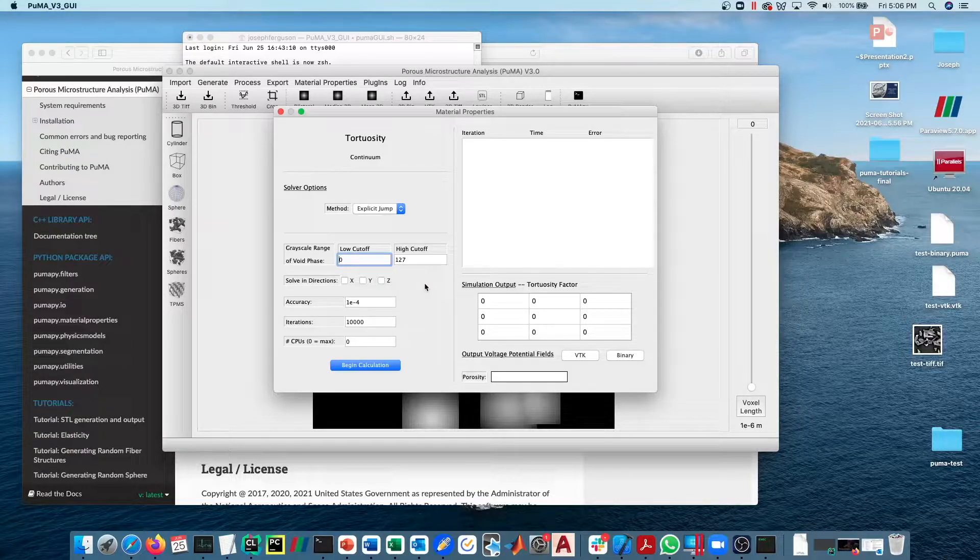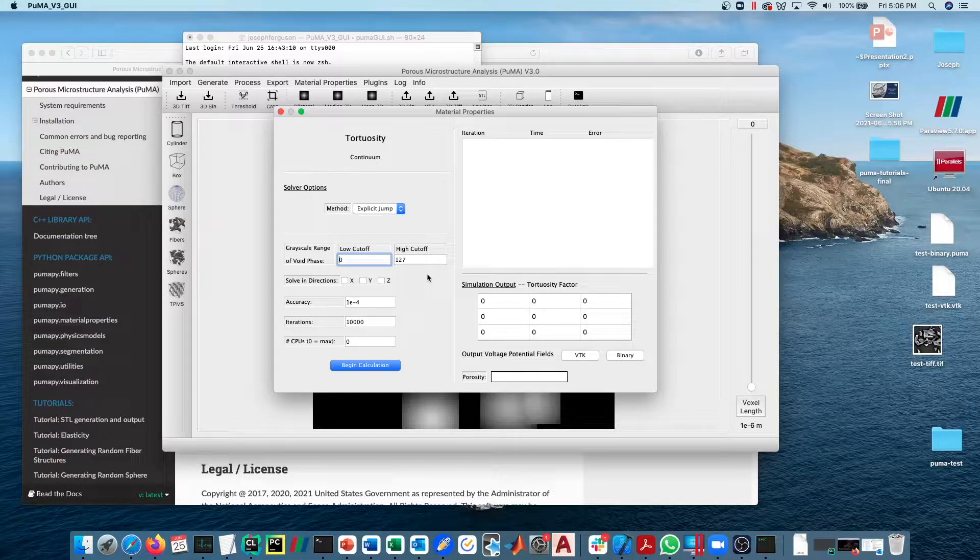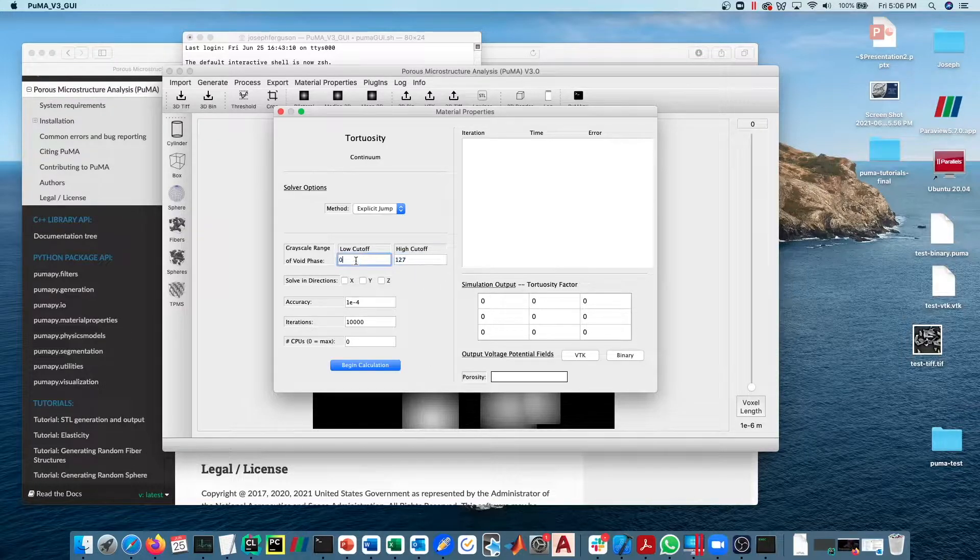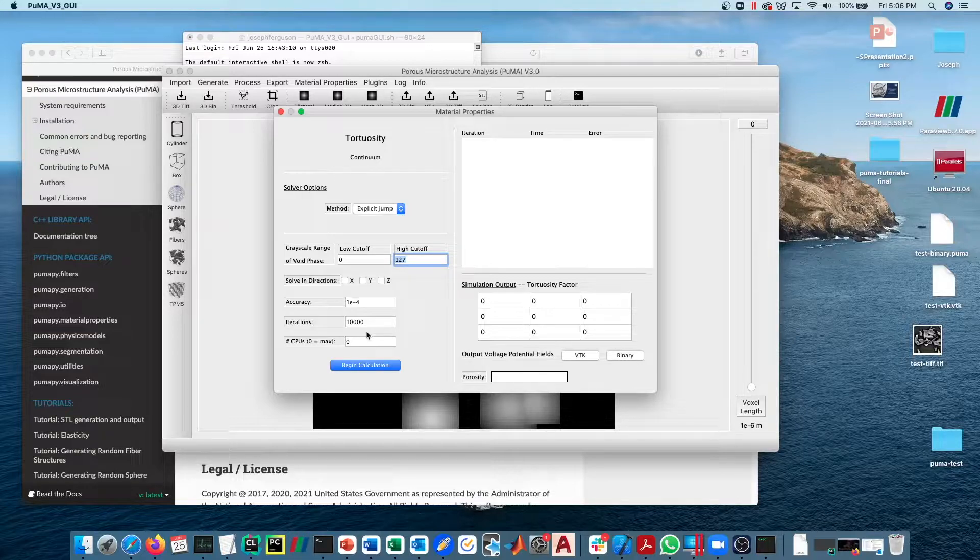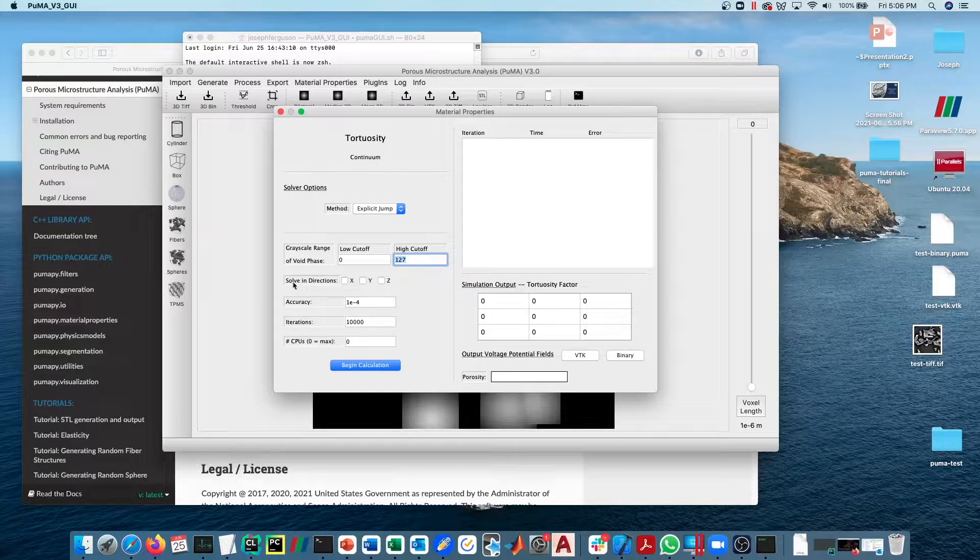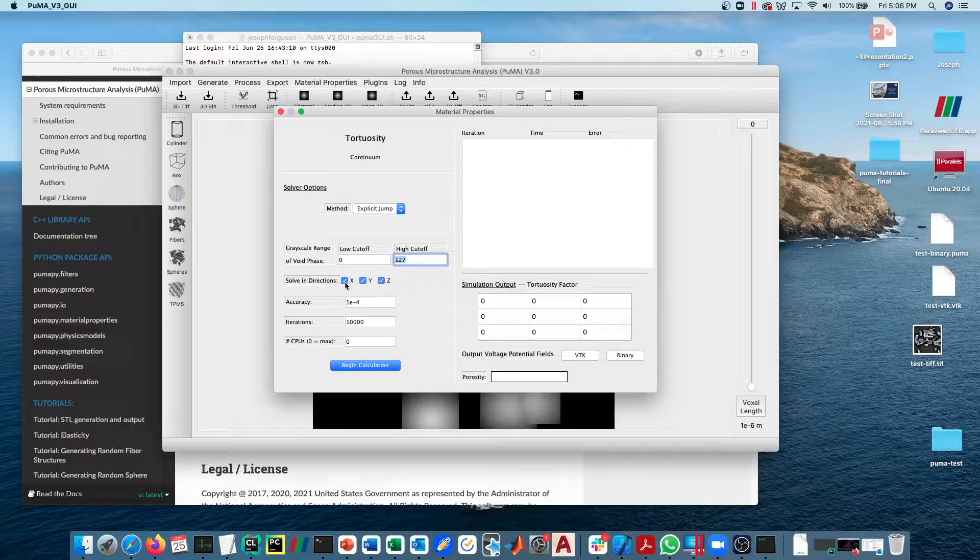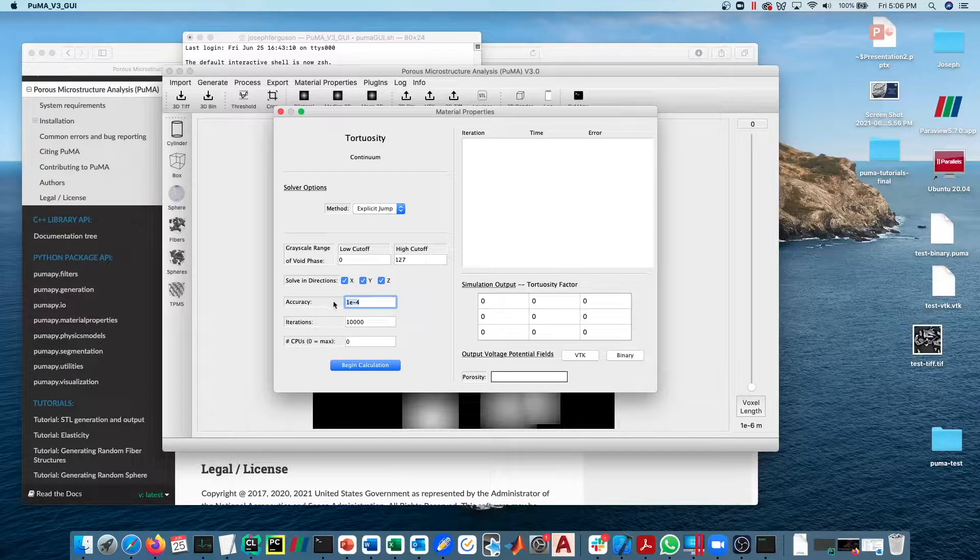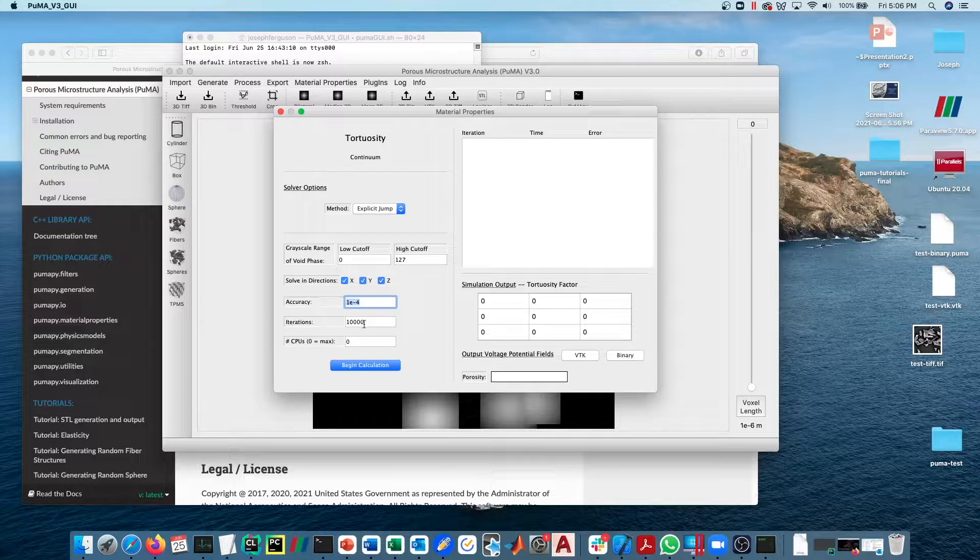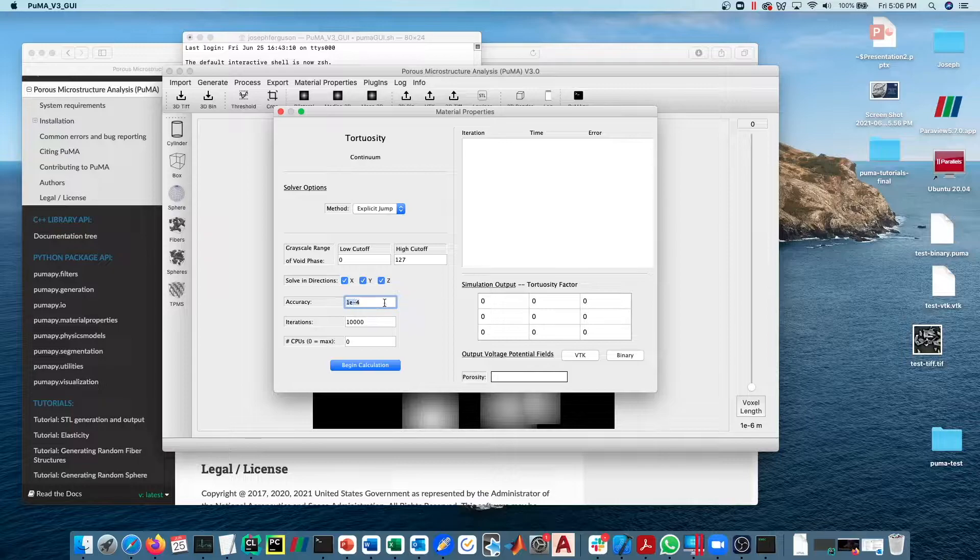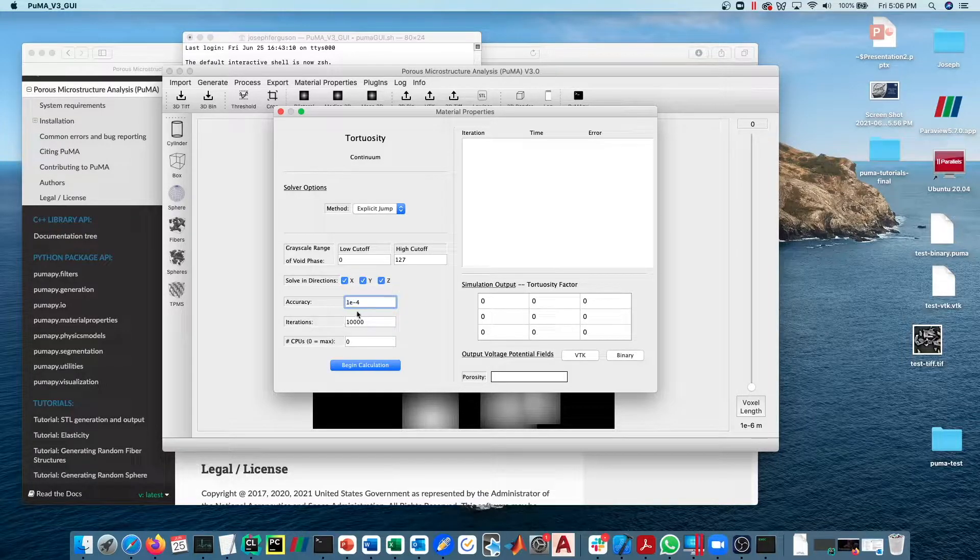Let's start with the explicit jump solver using periodic boundary conditions. The grayscale range of the void phase has to be specified. By void phase I just mean the phase that the air will be diffusing through. In the case of this generated material, zero to 127 is the phase we want to use. If you were using a tomography sample, this would of course be different for each tomography sample. Solver directions are calculating the tortuosity in which directions. If you select them all, then we're going to calculate the tortuosity in all three directions. Accuracy is just a measure of when the iterative solver is going to say it's good enough, we've reached steady state. Typically 1e-4 is what we use, but you can make it more accurate if you would like.